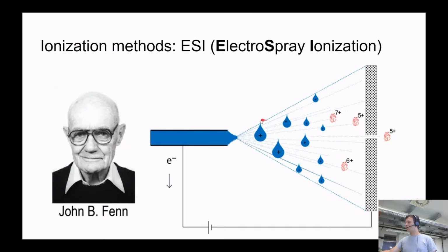So what's happening then? All molecules in the liquid are deprived of electrons, and by constantly pushing, you're basically creating some kind of stream. You're making clouds of droplets. The droplets are heavily positively charged, and what's cool is that these positively charged droplets fly to the instrument. In these droplets, there are contents like peptides or proteins and some liquid. Let's say the medium is just water. When this droplet is flying to the instrument, the water is evaporating from the droplet, and the droplet is shrinking. It shrinks until a certain moment when the positive charge on the surface of the droplet starts really disrupting it. And there's a really big discussion about what's happening exactly in this moment.